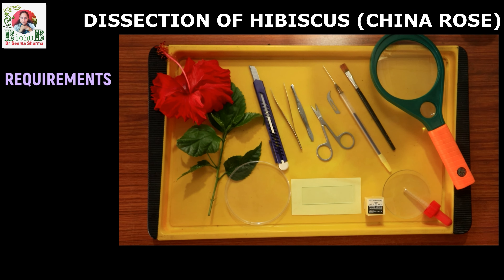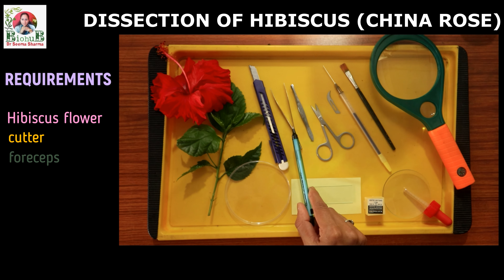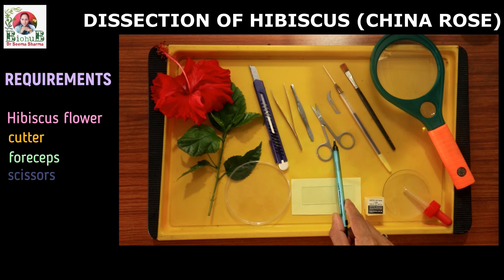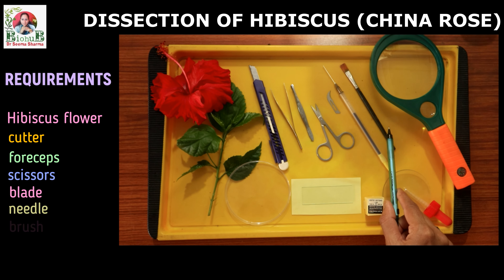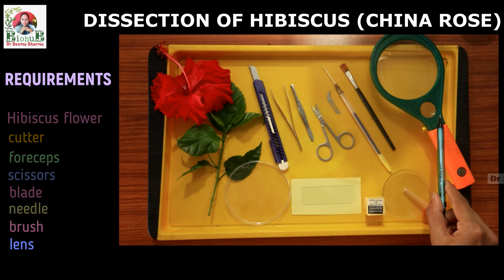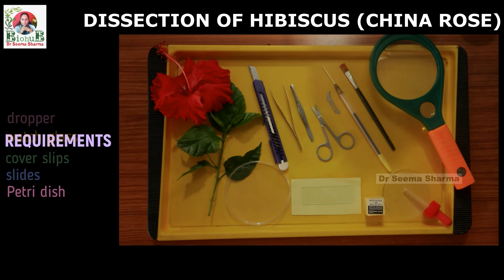Materials required: one freshly plucked flower, cutter, forceps, a pair of scissors, surgical blade, needle, brush, hand lens, dropper, watch glass, cover slip, slide, and petri dish.